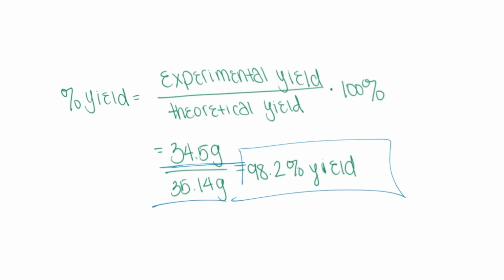However, some ways that we could have been below the theoretical yield is when we were washing the alum, if some of it went through the filter and so we lost some alum, or since all of the measuring devices have a percent error associated with them, it is nearly impossible to get a perfect measurement. So those two things could contribute to having less than 100% yield.